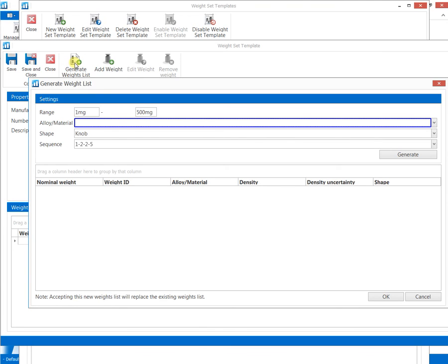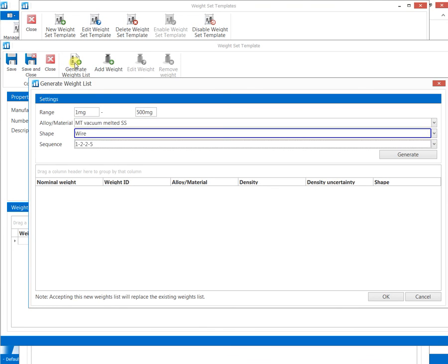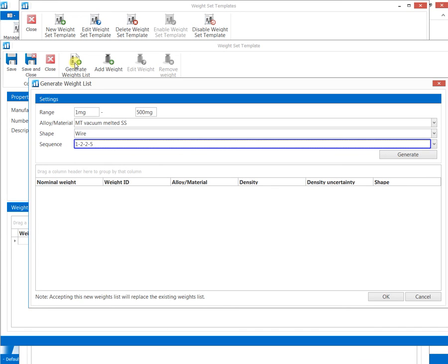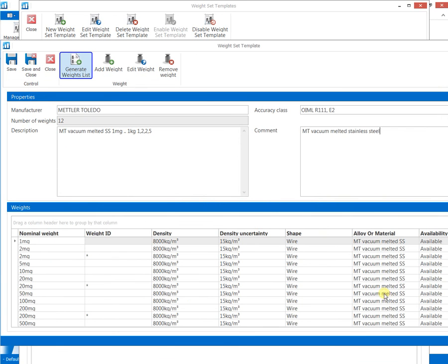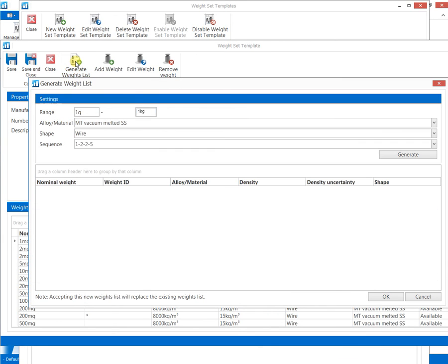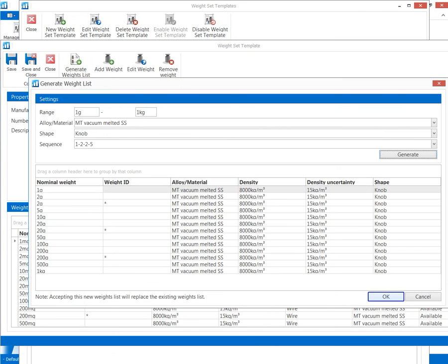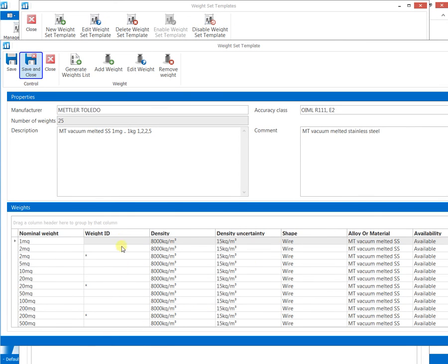The smallest and the largest weight, the shape and the sequence are defined, and the weight list is generated automatically. Weights not included within a sequence may be added later, enabling full flexibility for weight set definitions.